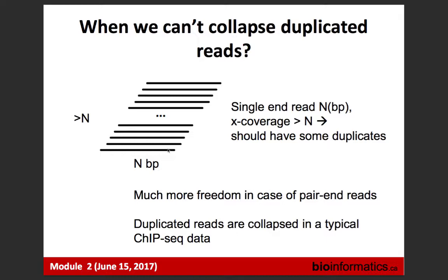Why can't we use duplicated reads to increase coverage? Because it gives you the same information, right? It confirms your first read, but it's a bit dangerous. First of all, it was just one molecule. Biologically, one cell gave you this piece of DNA, but then you have duplicates, say multiplicated 50 times. Imagine it was just background. This molecule was noise. It was not properly, specifically IP'd. Then it was PCR amplified, and we have 50 copies of it. Then you have a nice, fantastic-looking tower, like enrichment, but it's completely false because you don't have enrichment there.